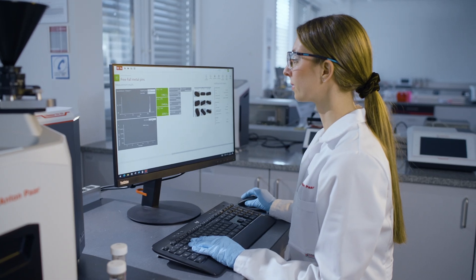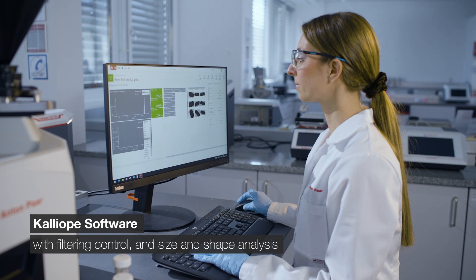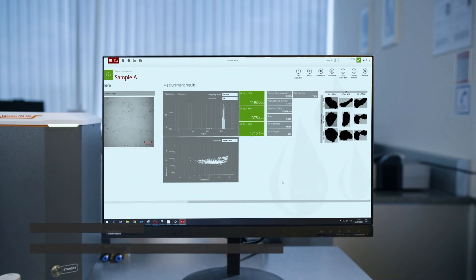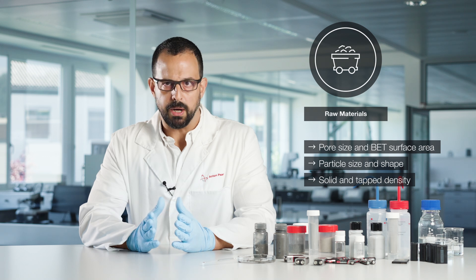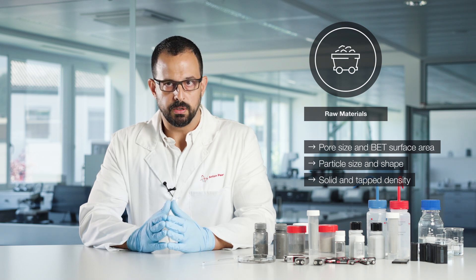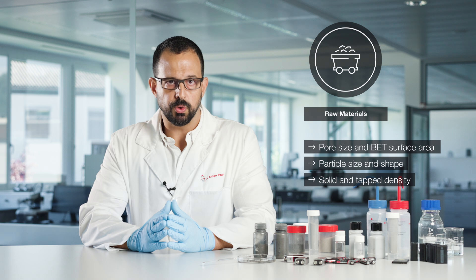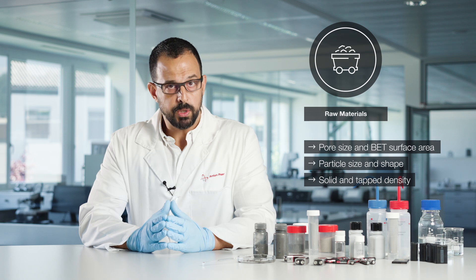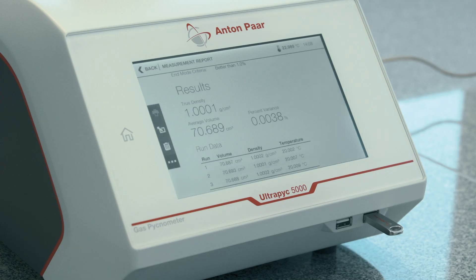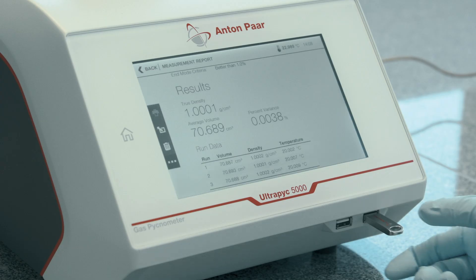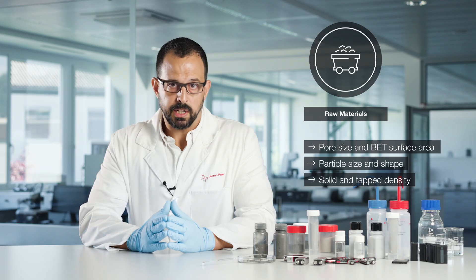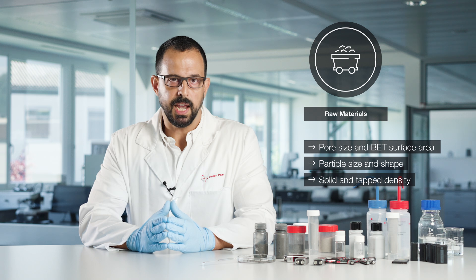Exact images of particle shapes are captured with dynamic image analysis. Apart from that, the solid density of any powder is an important parameter to measure, and this is especially true for battery materials. Important solid density parameters are the true density, which is also known as skeletal density, and this is measured with a technology called gas pycnometry, and tap density, which is measured with a tap density analyzer.